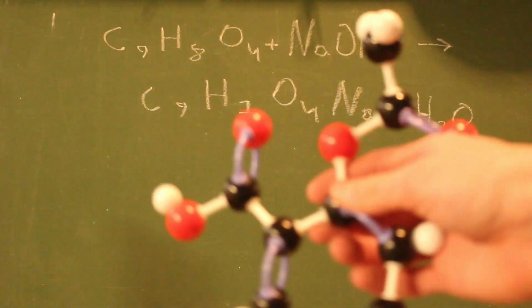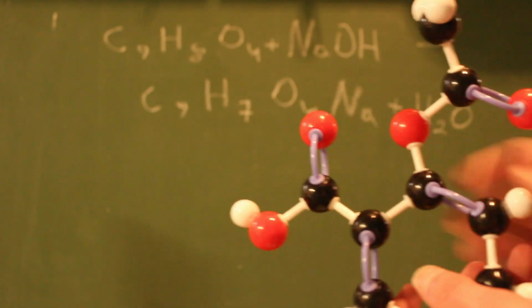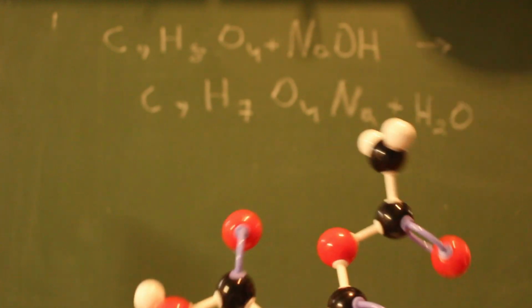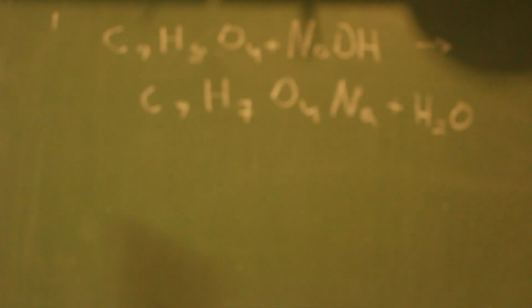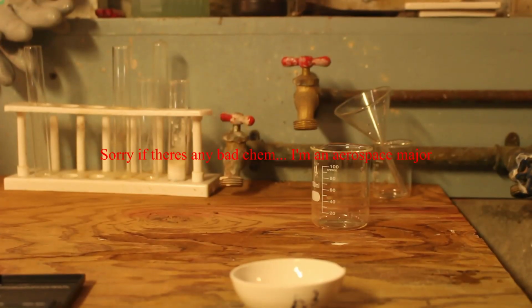So I created this really terrible model that's out of focus. Now, you might be like, hey Liam, where's the sodium? You kind of forgot that bit. It's here, but it's because it's not directly bonded. So, you got a nice ring. Anyway, let's skip that part because I've probably already lost 50% of you from that. Let's go to the actual reaction now.